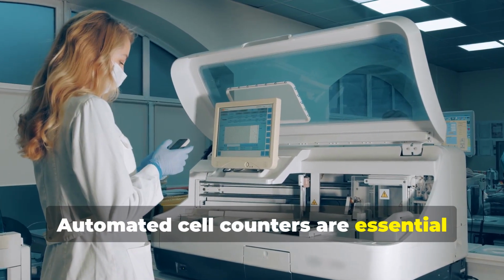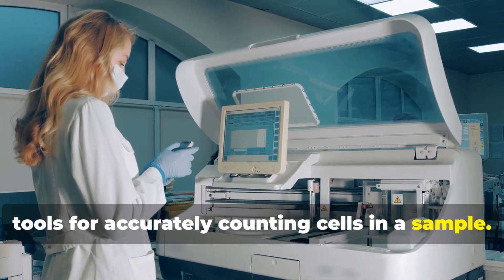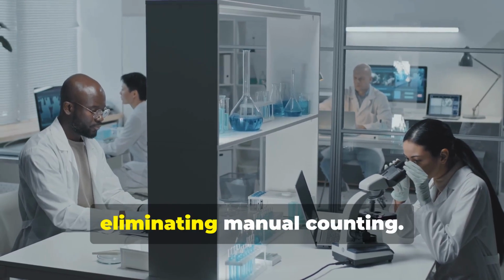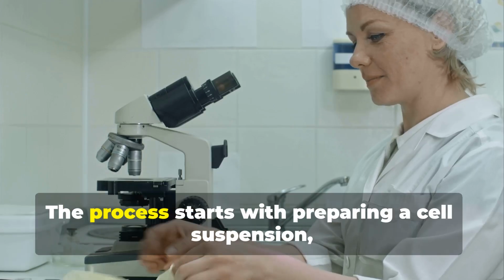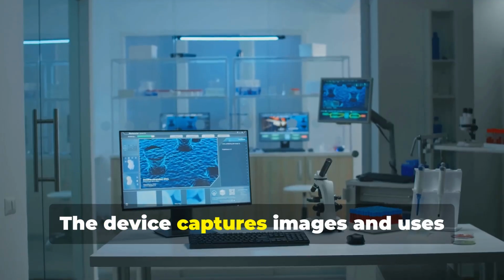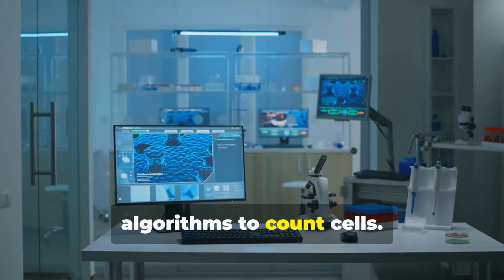Automated cell counters are essential tools for accurately counting cells in a sample. They use advanced imaging technologies to provide precise counts, eliminating manual counting. The process starts with preparing a cell suspension loaded into the counter. The device captures images and uses algorithms to count cells.